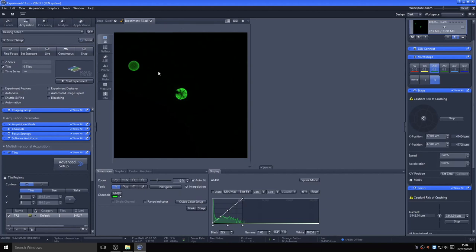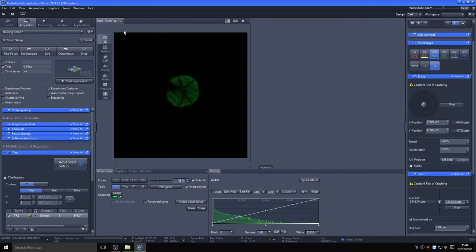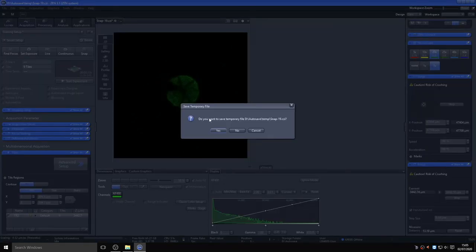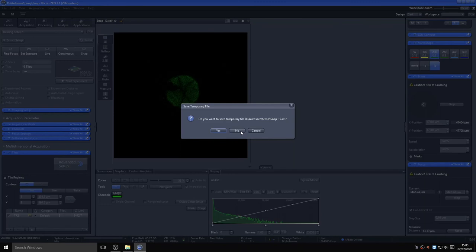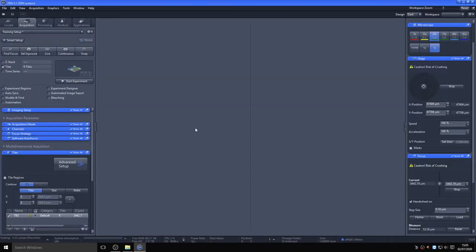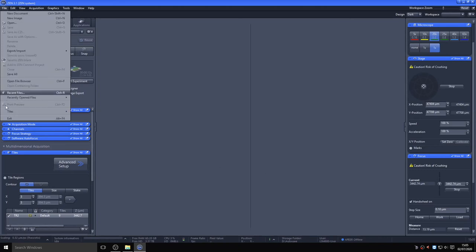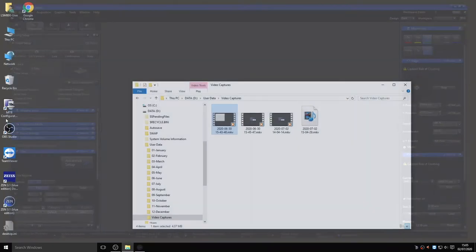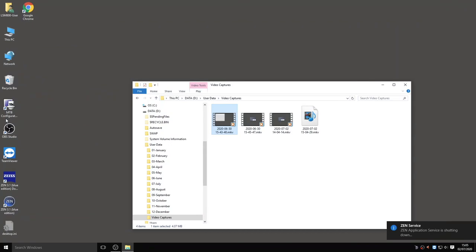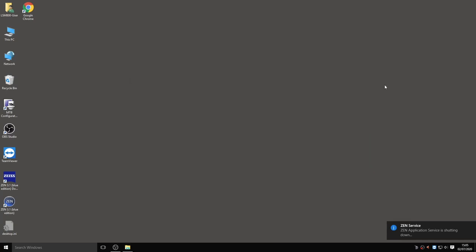You can export images as JPEG or TIFF for presentation purposes, but in the first instance, it is best to save the image in its original raw format. Once you have saved the images you want to keep and are ready to end your imaging session, close the ZEN program. You will notice the ZEN service continues to run in the background for about 20 seconds or so. The PC will not shut down until it closes.